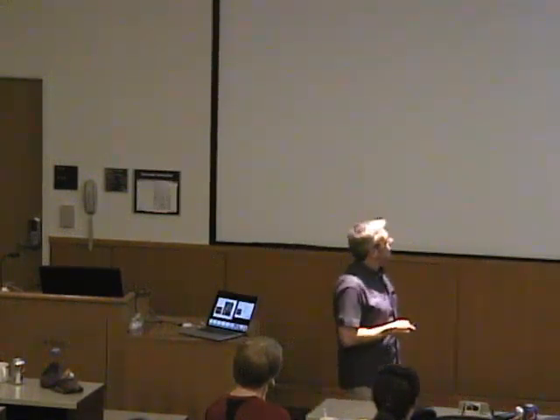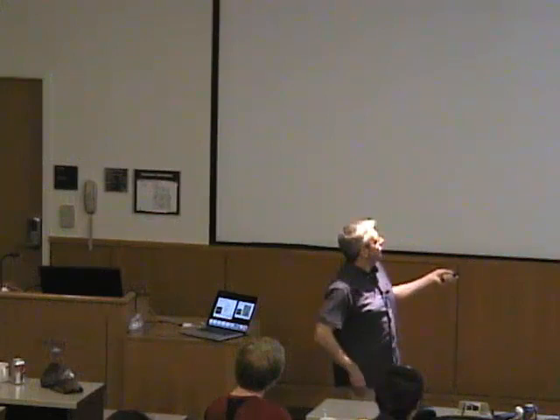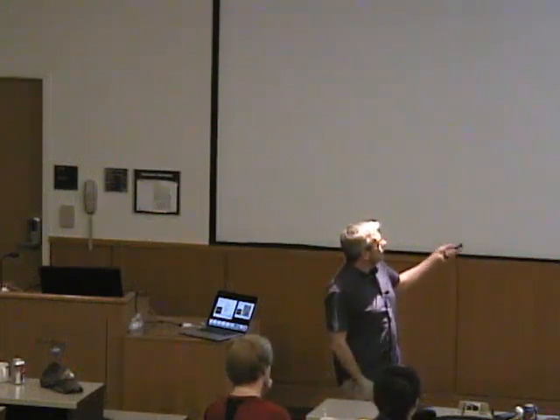This is Hawaii. I just want to use this to illustrate what an electron density map really is, because if you look at this Fourier transform of a diffraction image of Hawaii, then one way to represent it, maybe not such a beautiful way, but one that you find very often on maps, is something like this. You have your island, which has a certain height above sea level, so it's a three-dimensional object that you have in a two-dimensional representation, and in order to visualize this, you use contour lines.